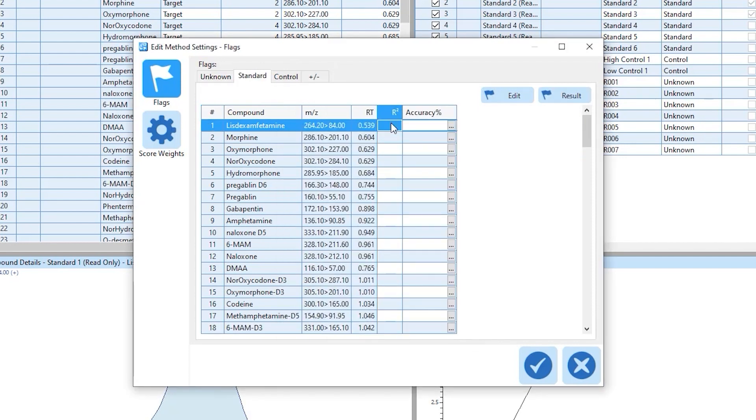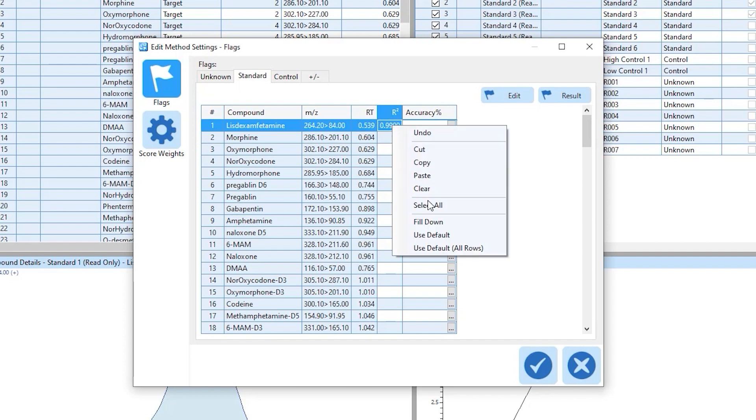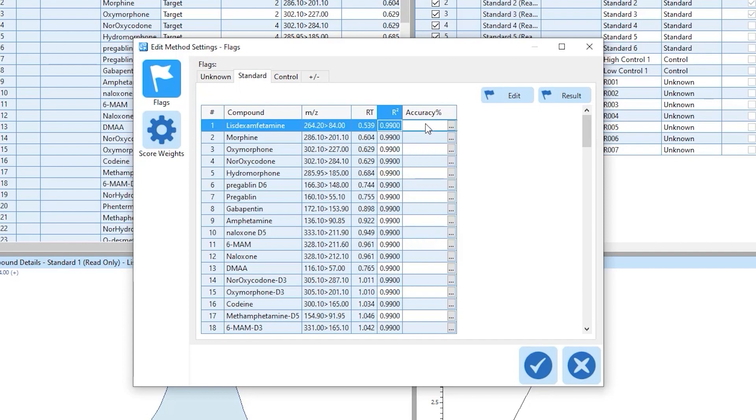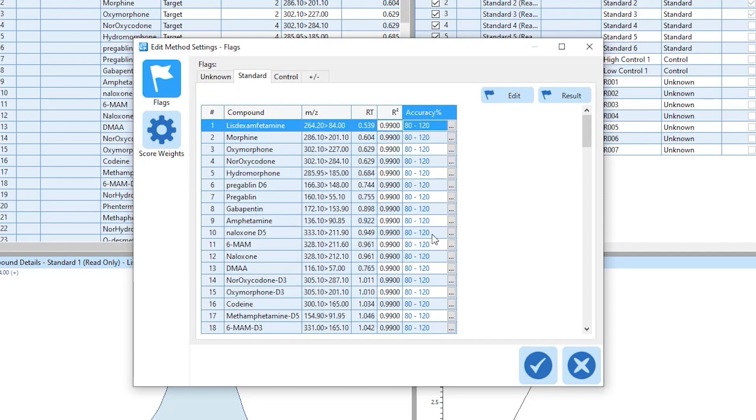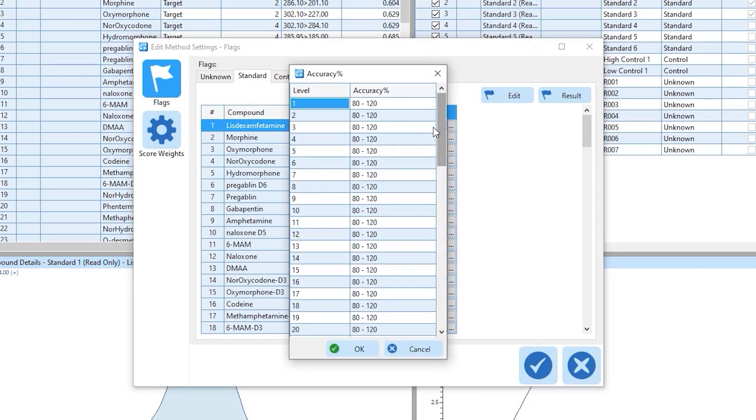Flagging values can be typed in or the box can be right clicked to use defaults or fill the value down. Some flag parameters, such as accuracy, can have the value set by the concentration level.